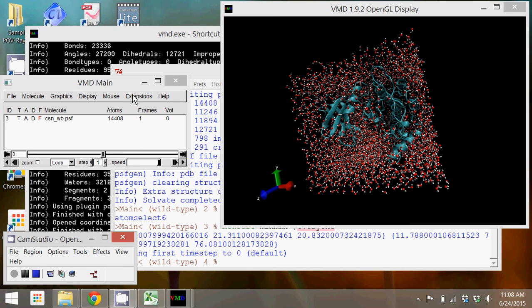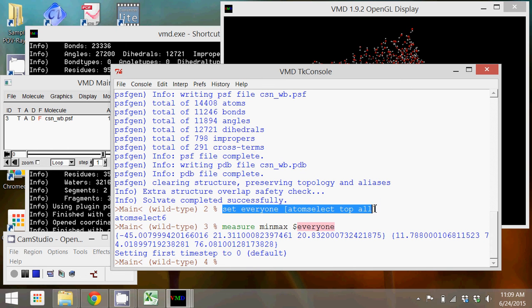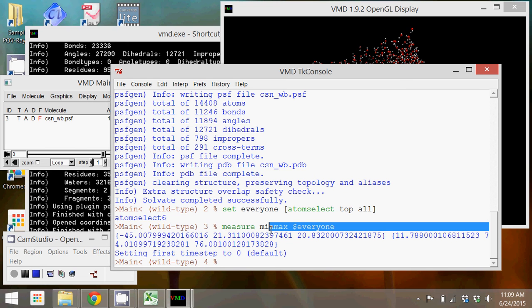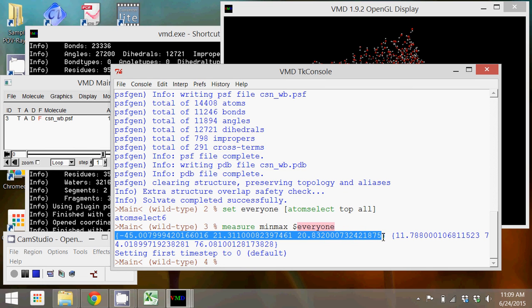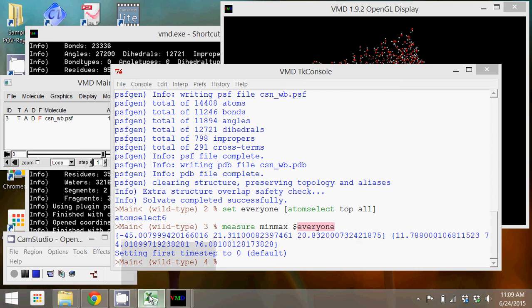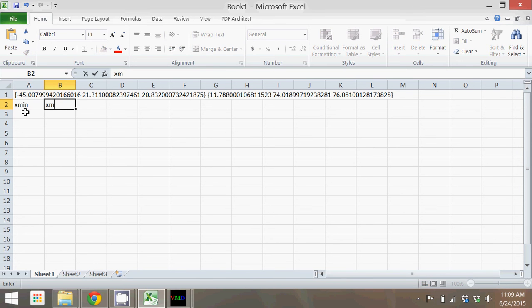The first thing we want to do is some calculations with those values that we obtained in the previous tutorial that indicated the size of our protein. We set a variable to capture all of the positions of the atoms in our structure, then we measured the minimum and maximum of that data and got two arrays of XYZ values, which we copied into Excel.